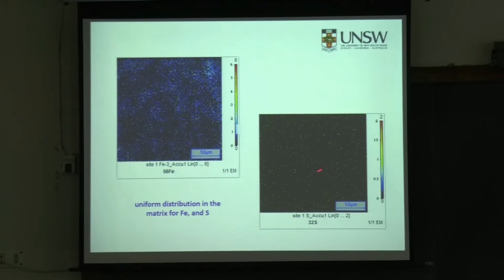You can see there is more iron with closer distribution, whereas there is less sulfur with more distance between them here. Once you do that, you can go back and use some of the scanning from the microscope program, so you can work out the distance between the sulfur particles. So SEM, SIMS, and then also use a SEM particle-to-particle distance program. So things can be much more informative.